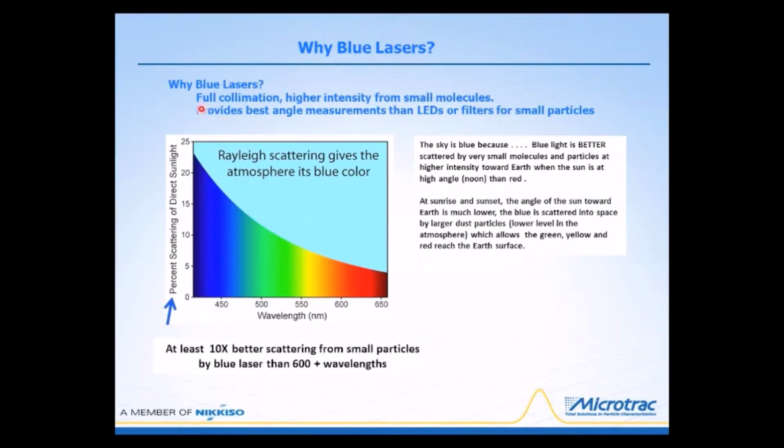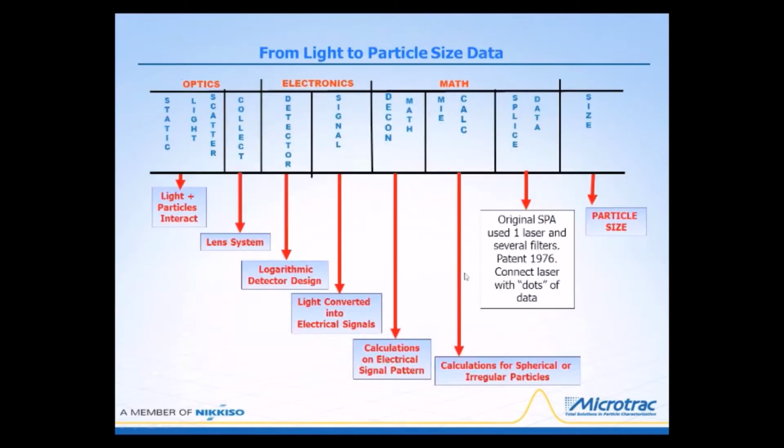Now, the whole idea is that using the blue lasers provides the best angular measurements for calculations from the fingerprint that's developed from the light scattering concepts. And this is much better than using LEDs or filters. These would be bandpass filters for the small particles.